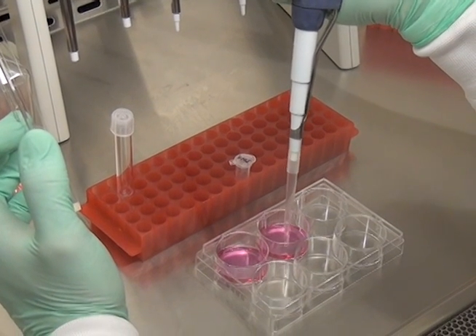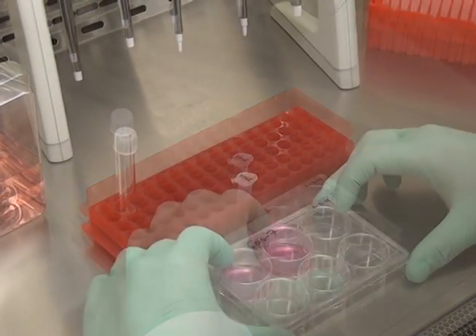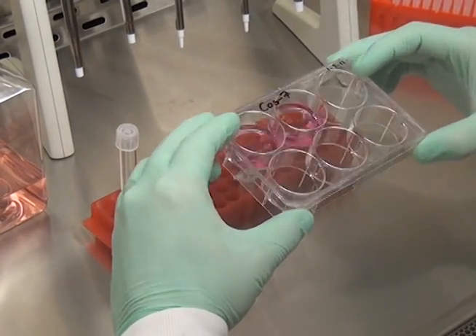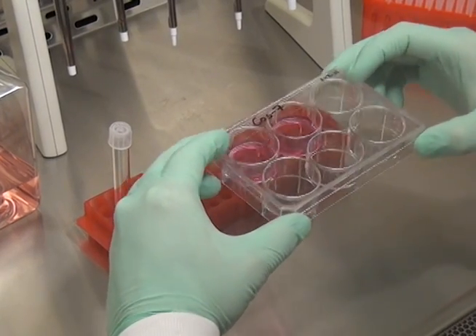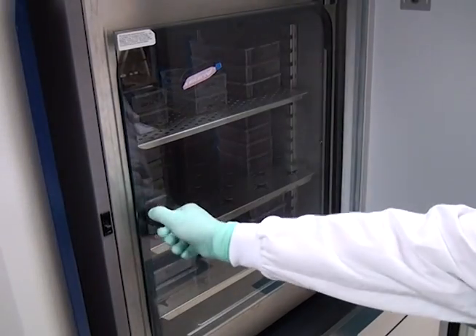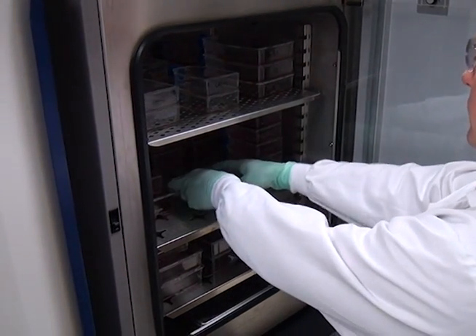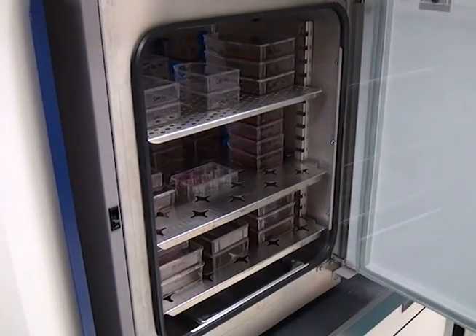Add the transfection complex dropwise directly to the cells in complete growth media. Mix gently by rocking back and forth in either direction. Transfer the culture plate to the tissue culture incubator set at 5% CO2 and 37 degrees Celsius, and incubate overnight or until harvest.